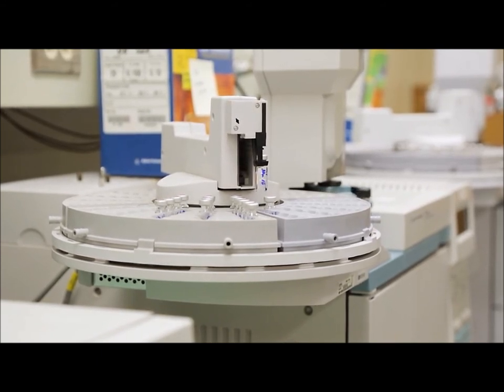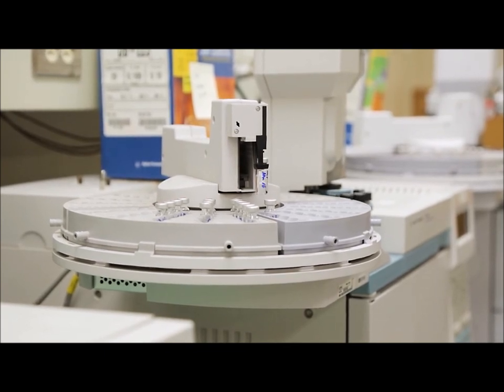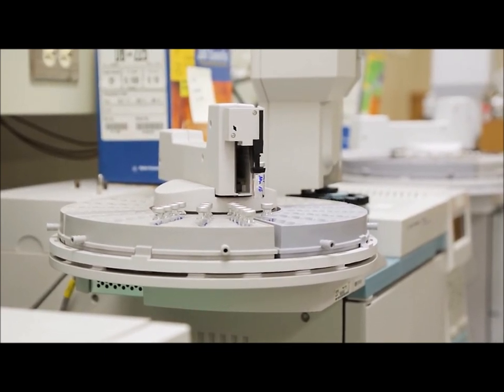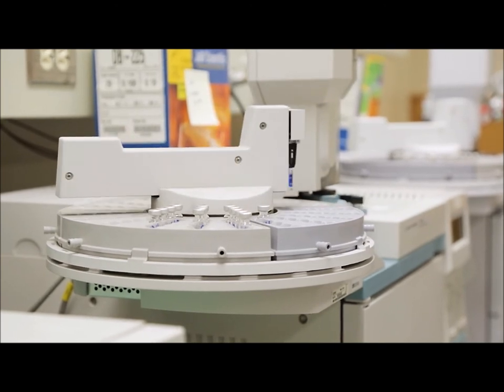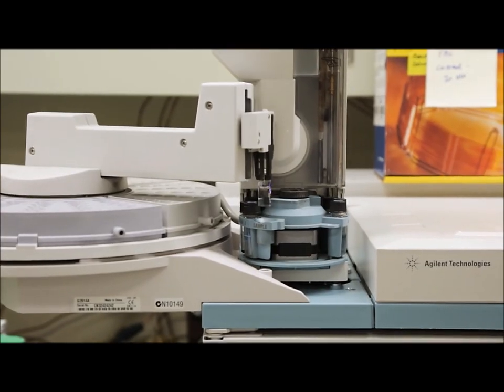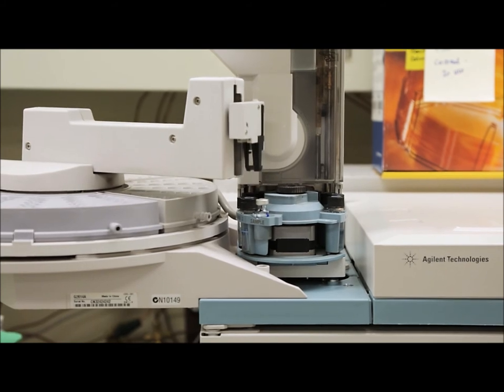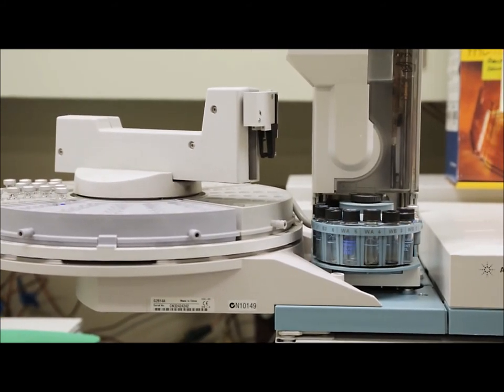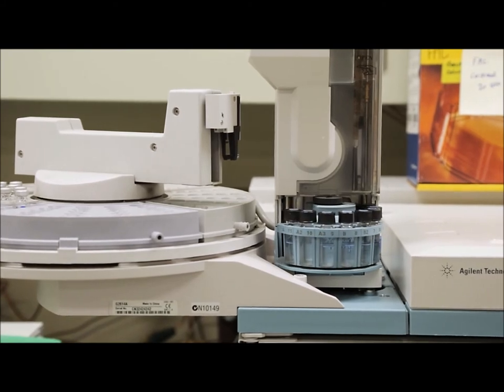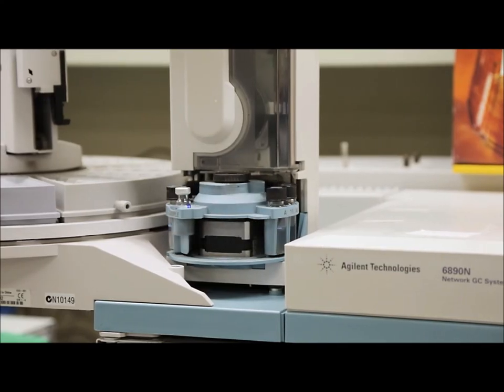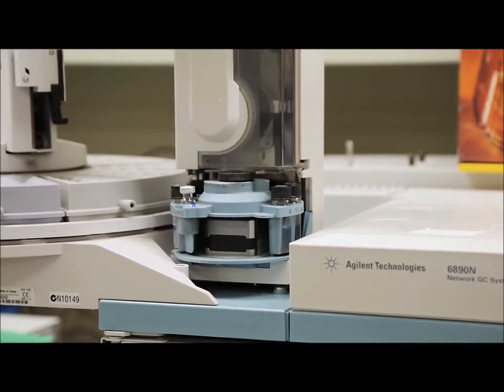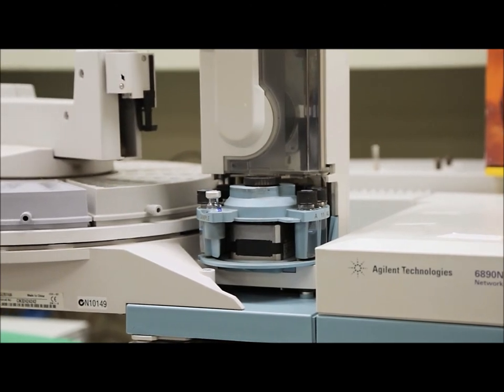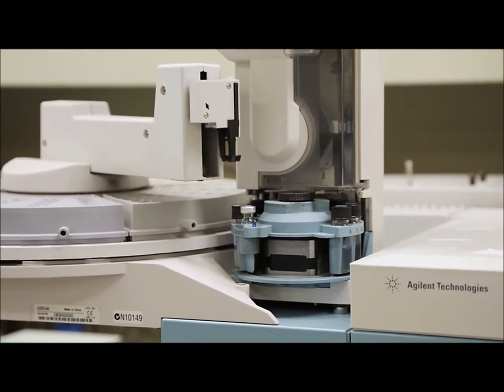The vials are placed onto the auto sampler tray of the GC. Everything is set up through the Empower software, so samples are injected through the software. The parameters of the Empower software, we follow the operating conditions for the GC as listed in the AOCS CE 1I 07 method.